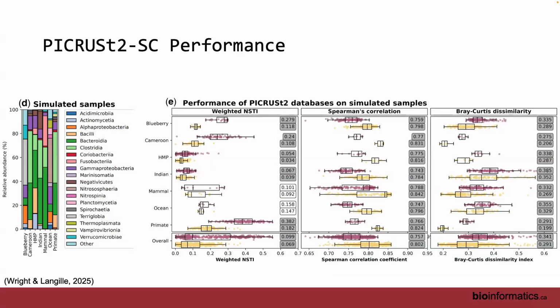That is one that we could not classify, or is it because the abundance in the sample was low? For the NSTI? The ones in the graph are some species that you could not classify. Oh, yeah. Sorry, yep. No, over here. Yeah, that's just low abundance.